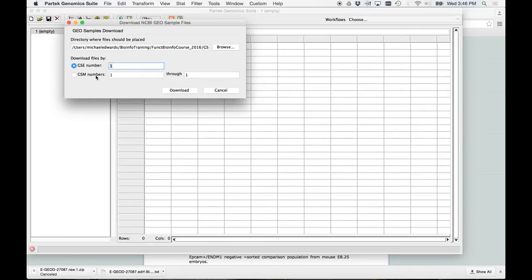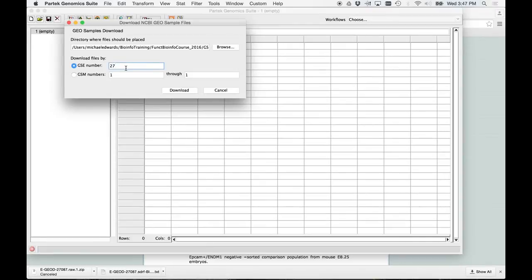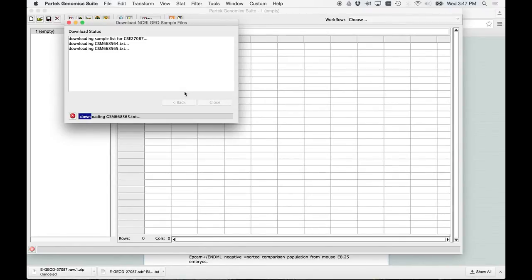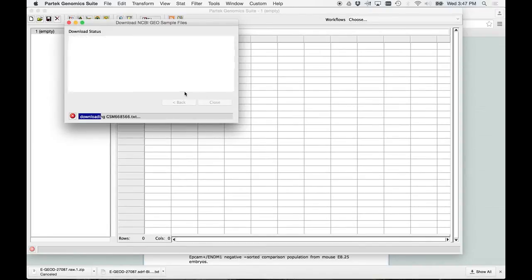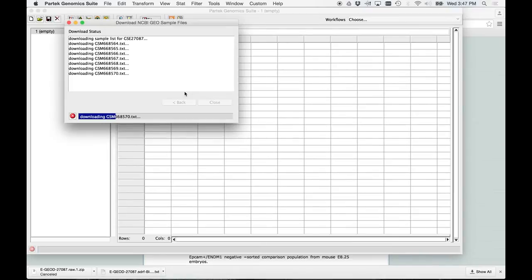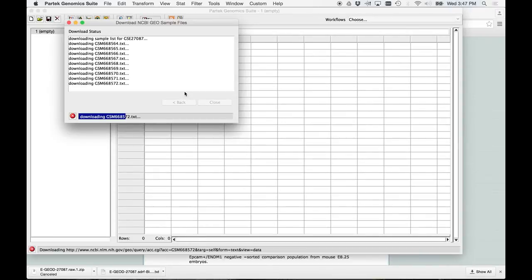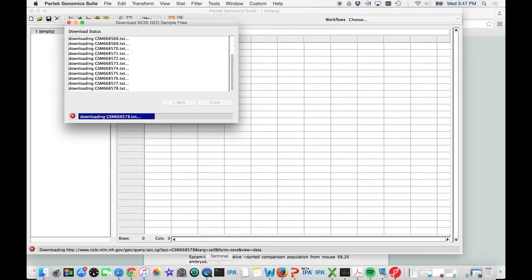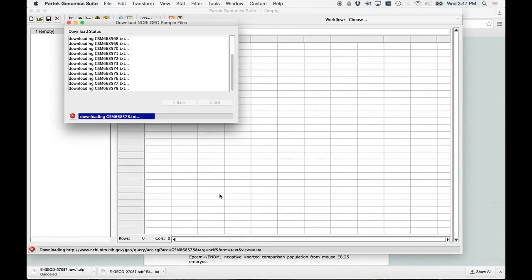All right. Now here's what we're going to do is we're going to tell it which study we want it to get. So you'll see this under GSE number, put in 27087. Okay. I'm going to hit download. All right. What it's doing right now is it's getting all those text files. Basically, since this is all the process data, it's basically giving the numbers for each gene for each individual sample. Right? So this isn't a big table. This is just for each individual sample. And what's going to happen at the very end is it's basically going to ask you to merge those files. Okay? And I'll show you how to do that. So this is going to take just a little bit of time. Oh, man, actually it's going pretty quickly.